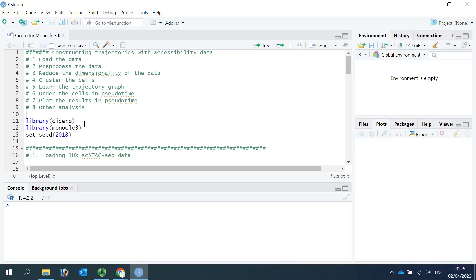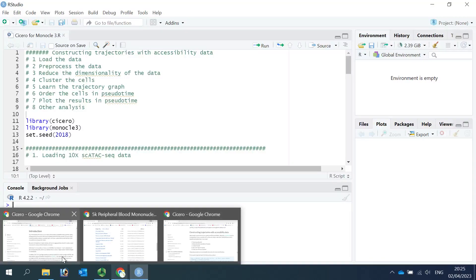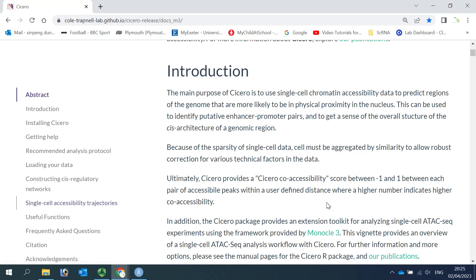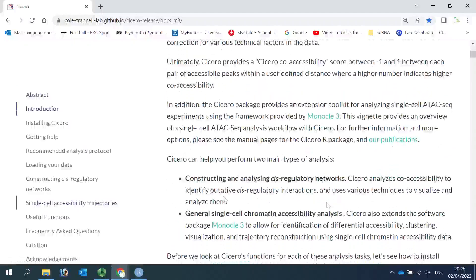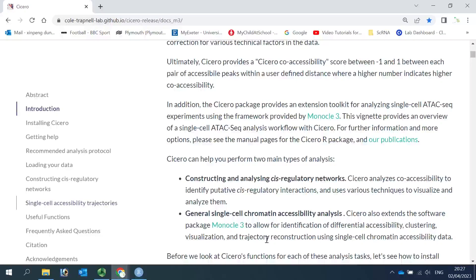For the analysis, we need the package Cicero and Monocle3. We can have a look at the online tutorial for Cicero. Cicero is a package developed to analyze single-cell ATAC-seq data for constructing and analyzing cis-regulatory networks. Cicero also extended the package in Monocle3 to allow identifying differential accessibility, cell clustering, visualization, and trajectory analysis.